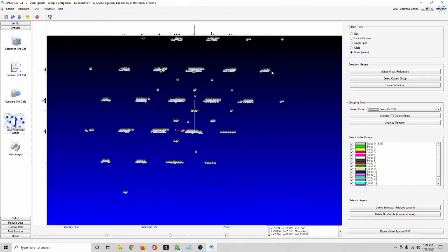So you see the B star direction there. The reason this lattice doesn't work so well is basically, if that's supposed to be B, it would ignore these, and it would also ignore these. These would not be accounted for. So you could see why these would just be systematic absences or something and would not be counted, because all B star is going to count is this and this and this, not that or these, anything in between that increment, because this is a reciprocal view of the lattice, of course.